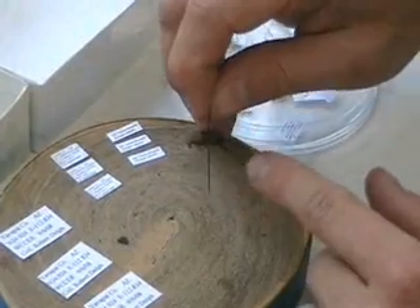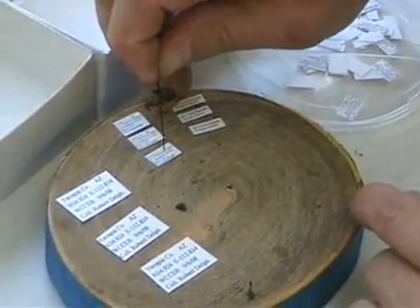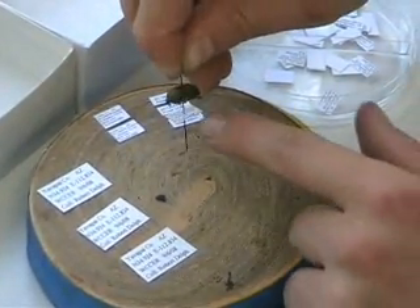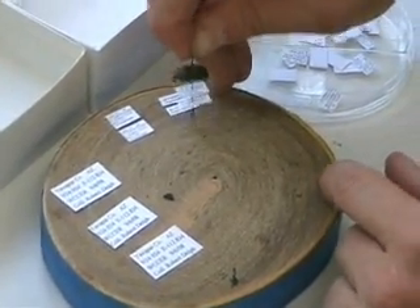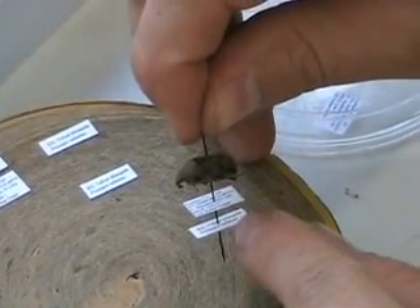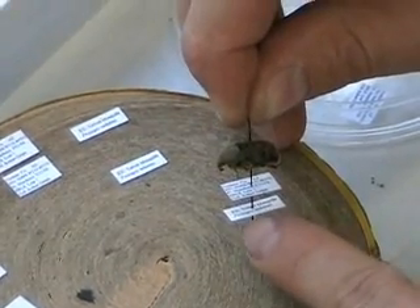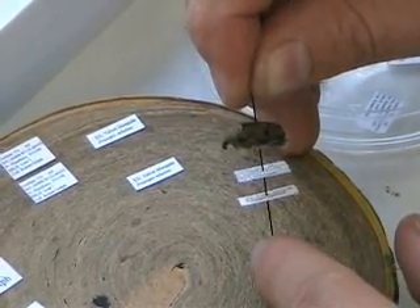Here is another pinned specimen. I'm going to pin it right through the center of the label so it's not affecting any of the words, and I also pin it through the second label. This second label is an extraction label — it says 'extracted from velvet mesquite,' which is a type of mesquite plant. You usually put the species name, so this beetle was collected off that particular species of plant.